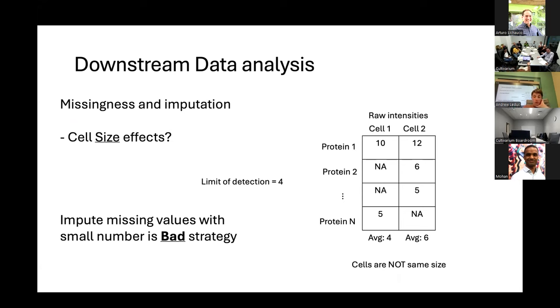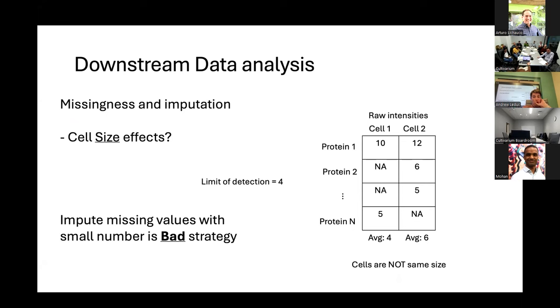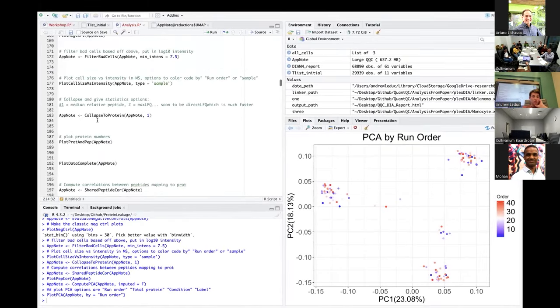Sure. Would it be the different cell type? Because the same cell type would be a similar size of cell, right? You have a lot of variation in... So if we look here and we go, what is it?